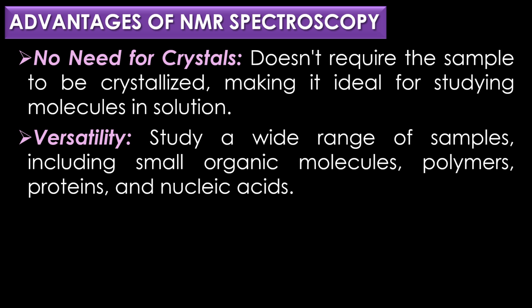The fifth and final advantage is versatility. NMR can study a wide range of samples, including small organic molecules, polymers, proteins, and nucleic acids.